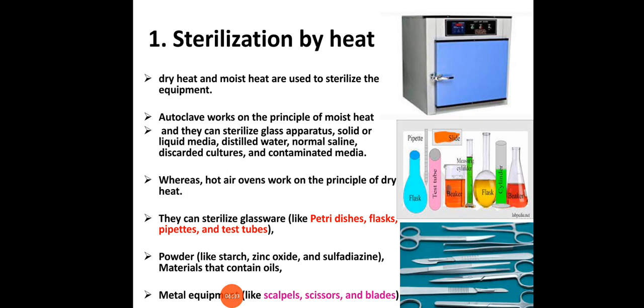In the sterilization by heat method, the hot air oven uses dry heat, and moist heat is also used to sterilize the equipment.